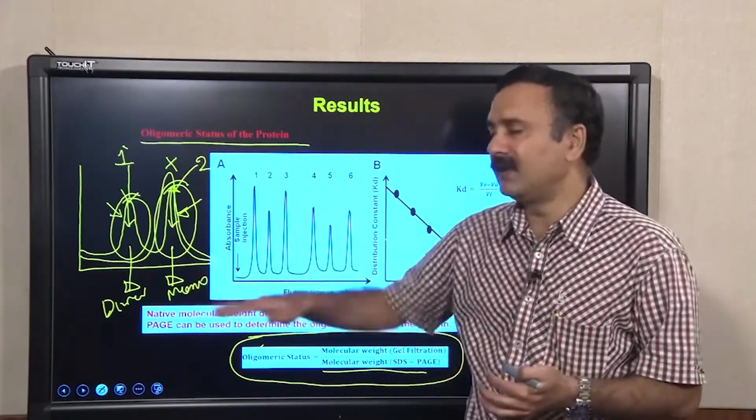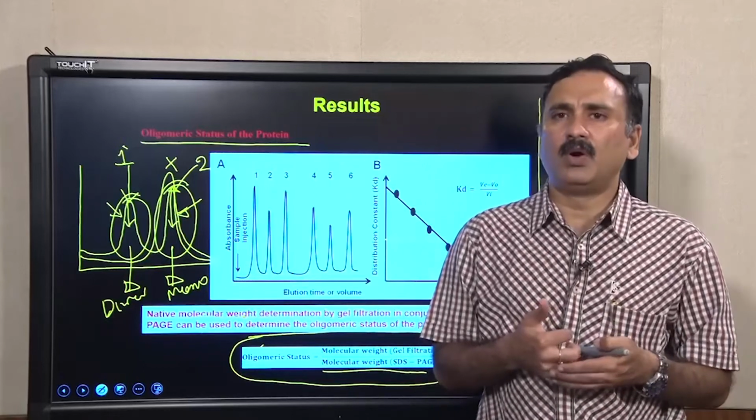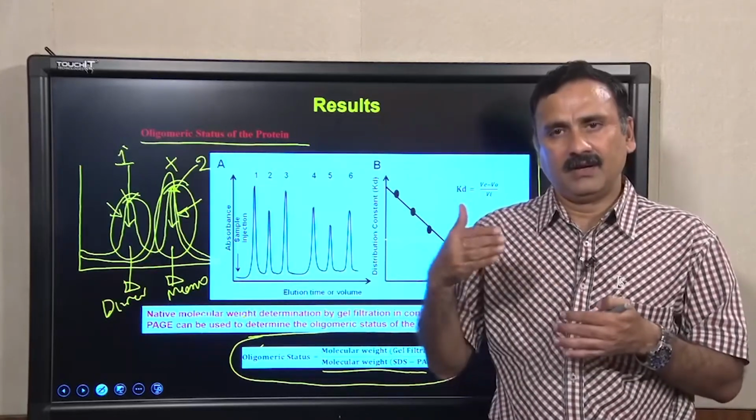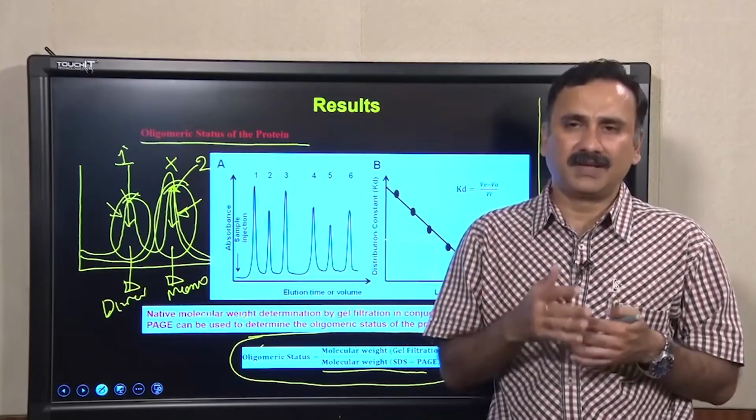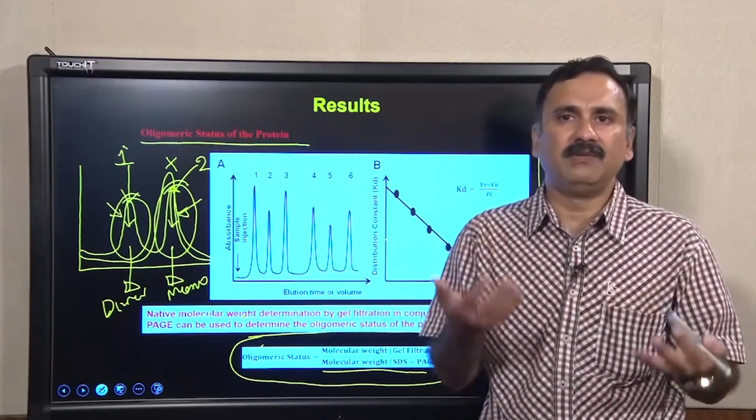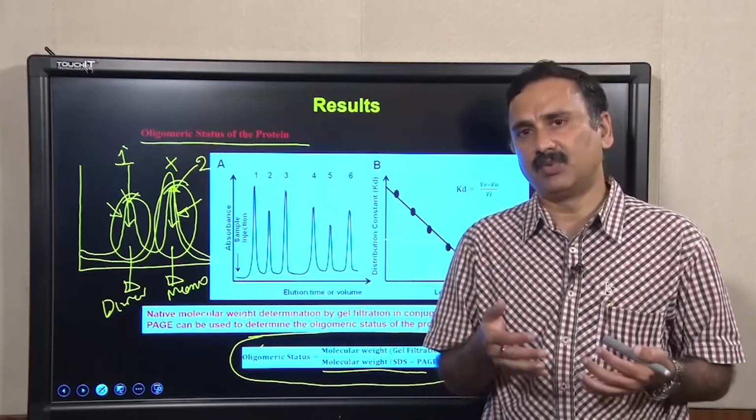So, that is also one of the strategies people plan and try, and that gives you the successful crystallization of a protein, and it eventually gives you the structure of that particular protein.